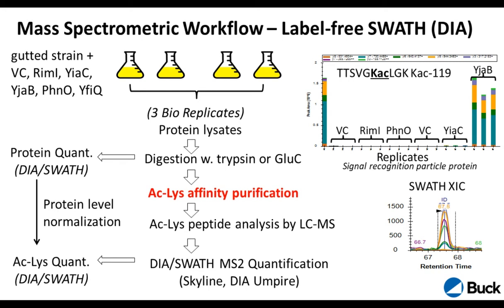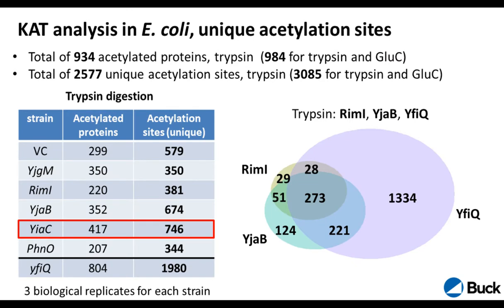We would do the quantification based on fragment ions. These here are peak area plots. And you can see, for example, for this particular peptide shown here on a protein called signal recognition particle protein, some of these acetyltransferase candidates would show a really high increase in acetylation levels and others not at all. So there was some exciting specificity that we could see here.